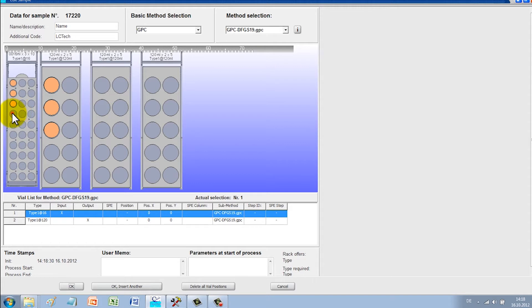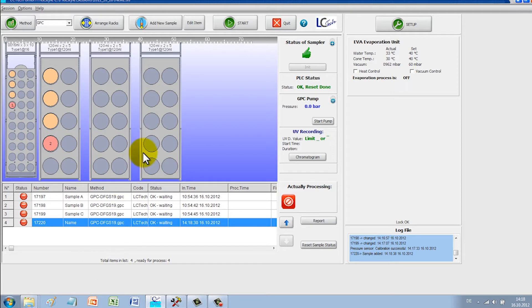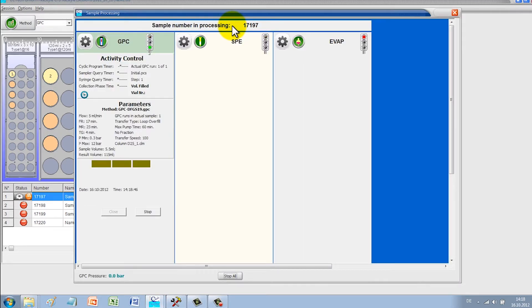As for your daily routine, samples are placed into the system, the method is selected, and then started. This can be performed by less experienced staff.